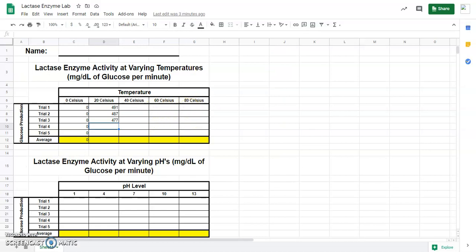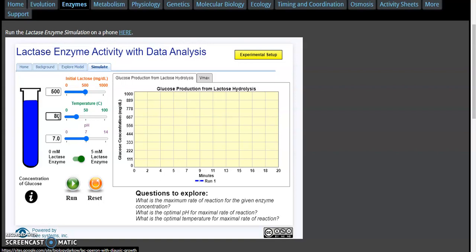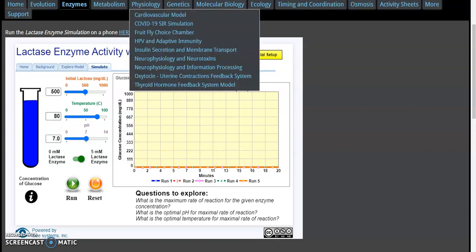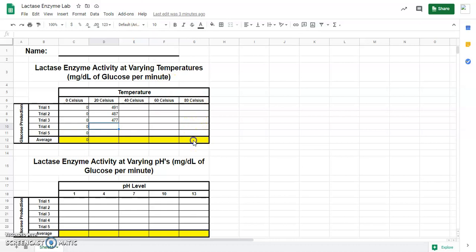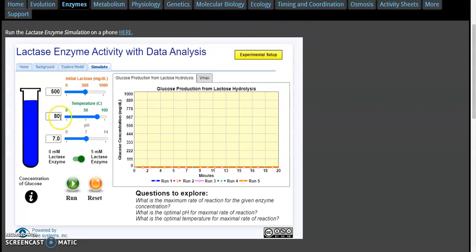Now go to 80 degrees Celsius. I'm going to hit reset, go to 80 degrees Celsius, and do five trials. Guess what? Every one was zero — zeroes all the way across. So zero glucose was made at a temperature of 80 degrees Celsius. We're going to put zeros all the way down and then average that at the bottom. Now we're going to do pH, but I'm actually going to have to do that in a separate video. I'll load that video separately — we'll be right back. Bye.